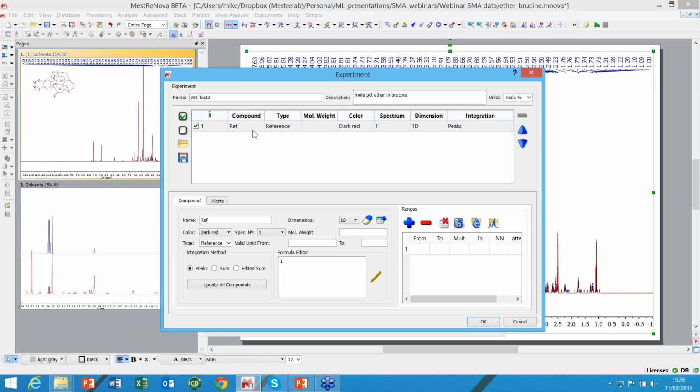This may sound a bit pedantic, but this can be quite a nice place to store constants. So even if you're not using a CCF value, and you had some sort of constant that you're using through a lot of your experiments, you could hide the value in here. Okay, so let's add to that.